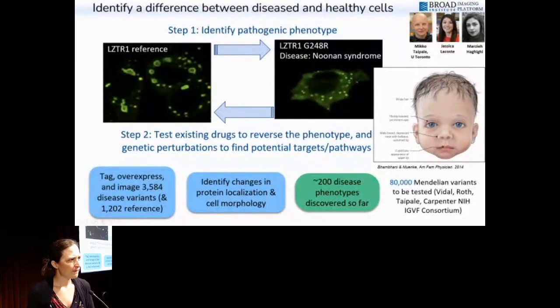This looks like a specific variant for Noonan syndrome. Do you have different variants? Do you have similar profiles, or is it very the same?